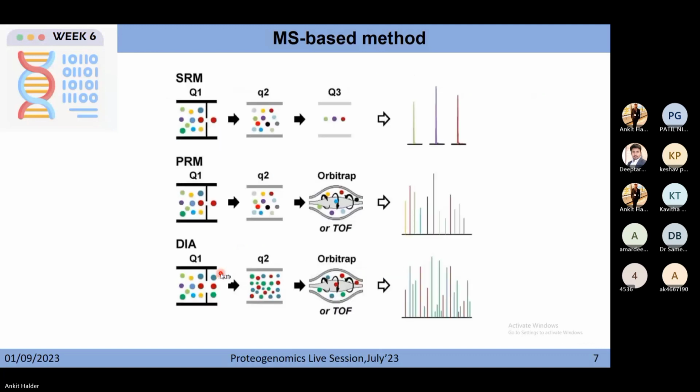These are the two kinds of techniques through which you try to validate, so let us go one by one. This is selected reaction monitoring or multiple reaction monitoring.